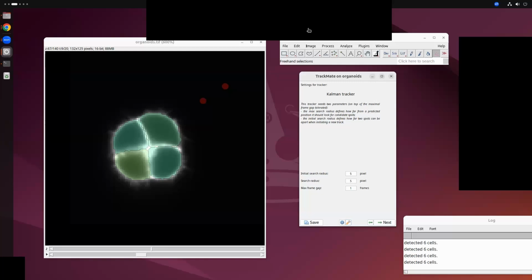So that doesn't capture the complete analysis result. Therefore, you can always re-render it using any 3D rendering engine once you have the mesh data. You don't even have to use ImageJ to render it. There's plenty of open 3D rendering software you can use once you have the mesh data.